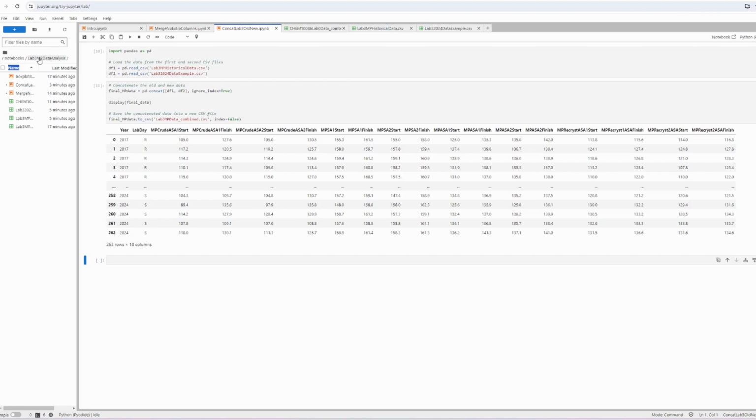So what you can do is you can do a lab 3 folder here, then a new folder called lab 4 and so on and so forth, and actually keep all your data straight. I've got to go and do that for my notebook and put everything in. But regardless, I uploaded these two files here, the historic and the new data that we're going to put in.